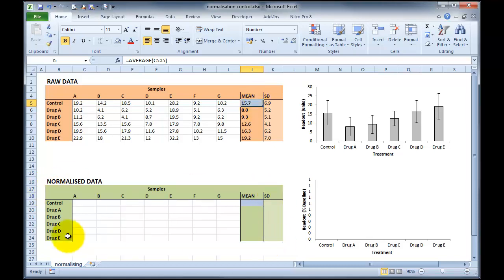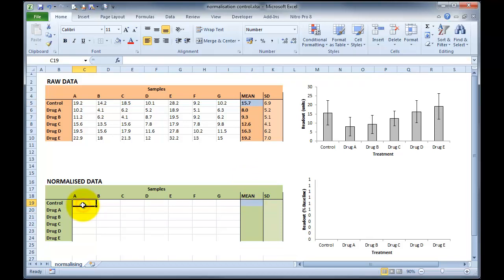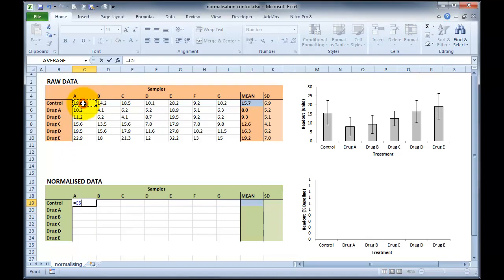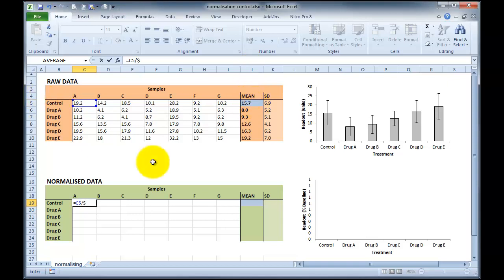So down here in the green section, we've got our normalised data samples, and I've highlighted the blue, which is going to be our mean. So what we can do is we can click in the first cell, and we can tell that this is our data point, our 19.2 data point. But this time it's going to be divided by the mean of all of the data points, in which case it is $j$5. So we'll type that in, and then we'll multiply that by 100 to get a percentage.